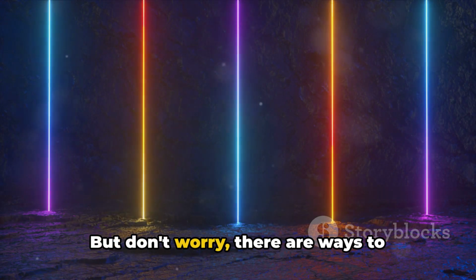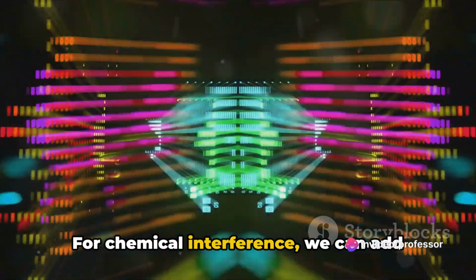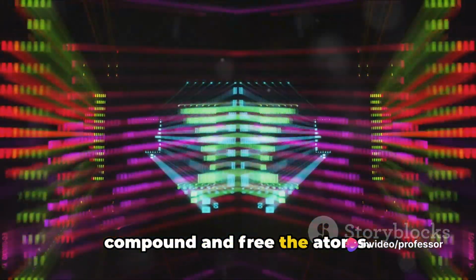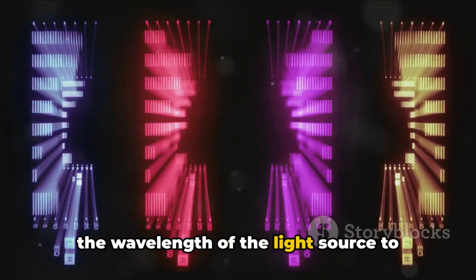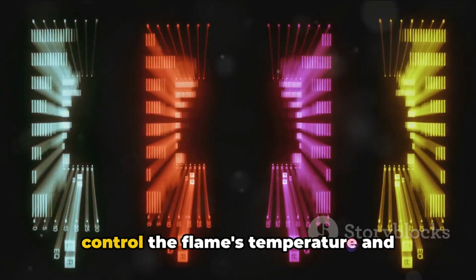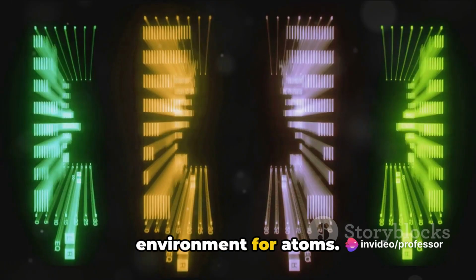But don't worry, there are ways to correct these interferences. For chemical interference, we can add releasing agents that break down the compound and free the atoms. For spectral interference, we can adjust the wavelength of the light source to avoid overlap. And for physical interference, we can control the flame's temperature and composition to ensure a consistent environment for atoms.